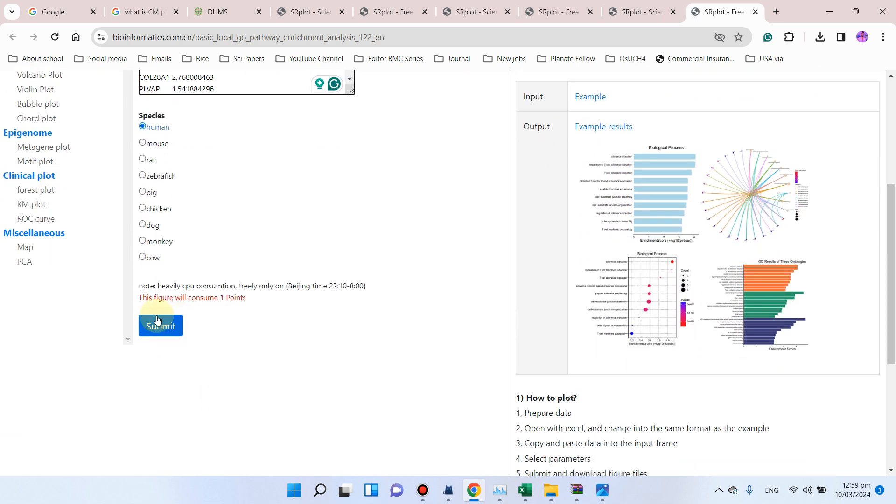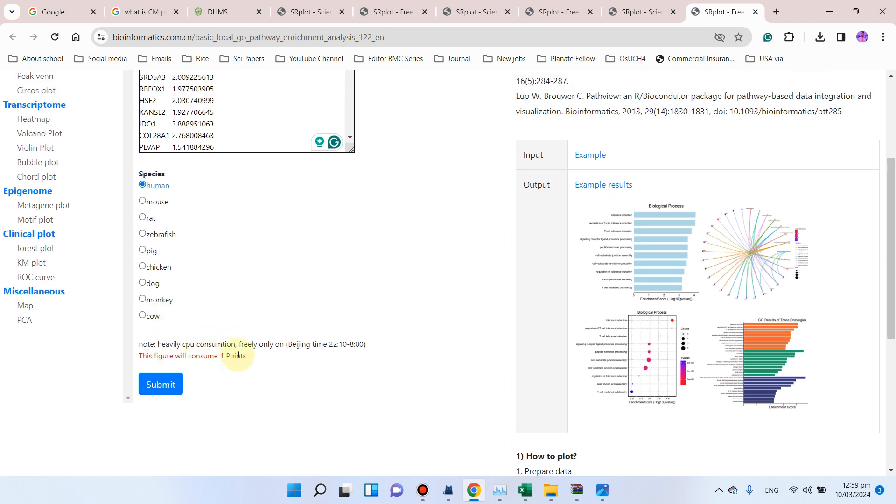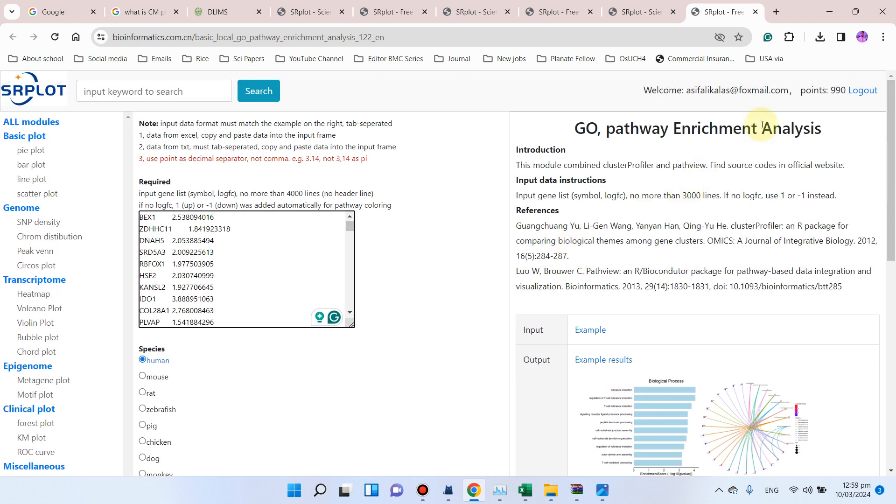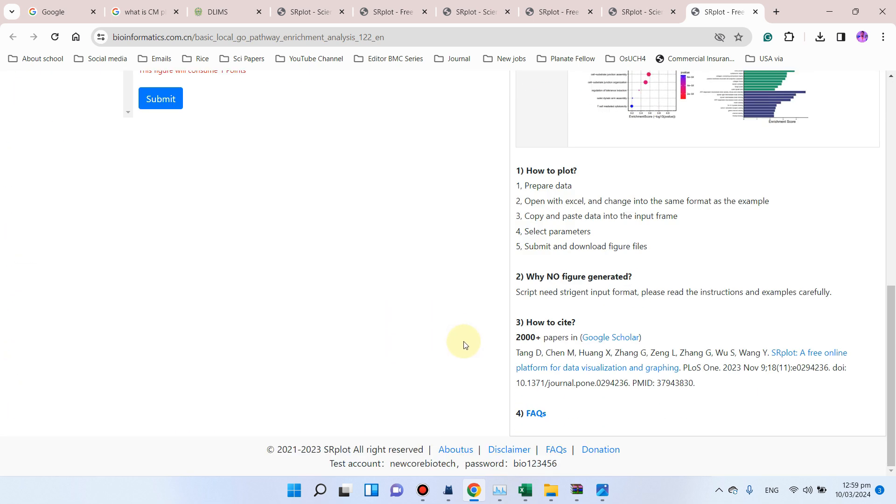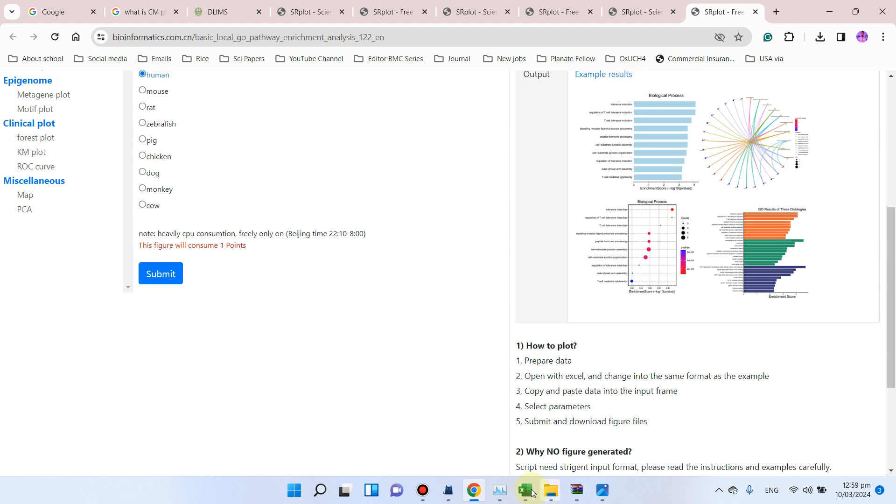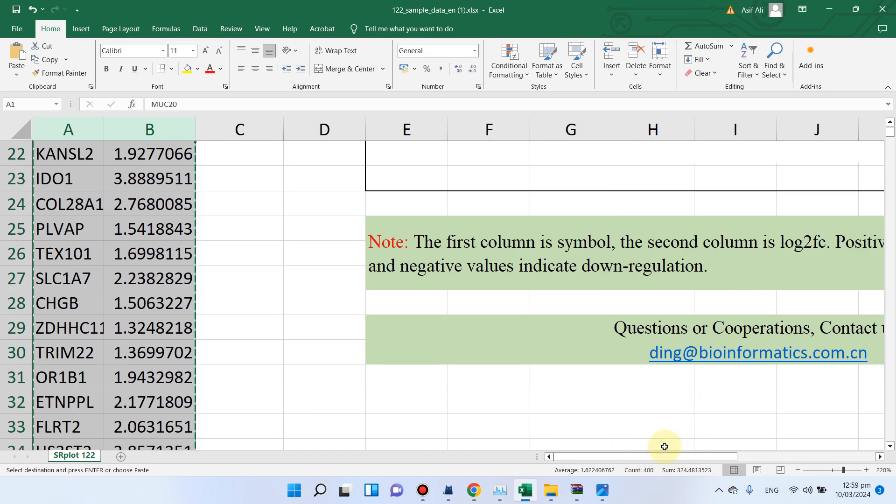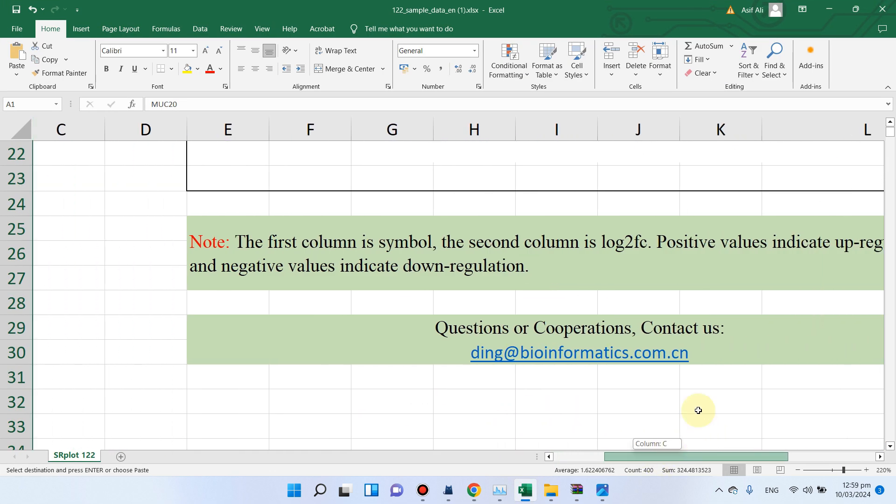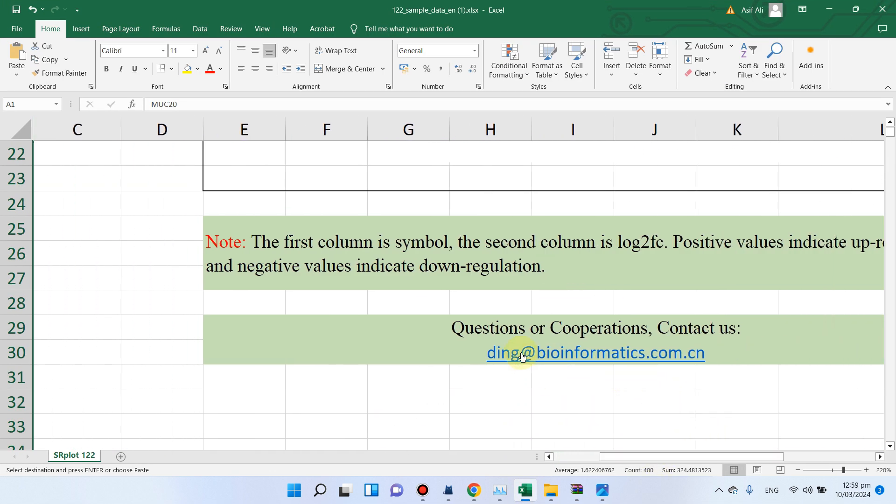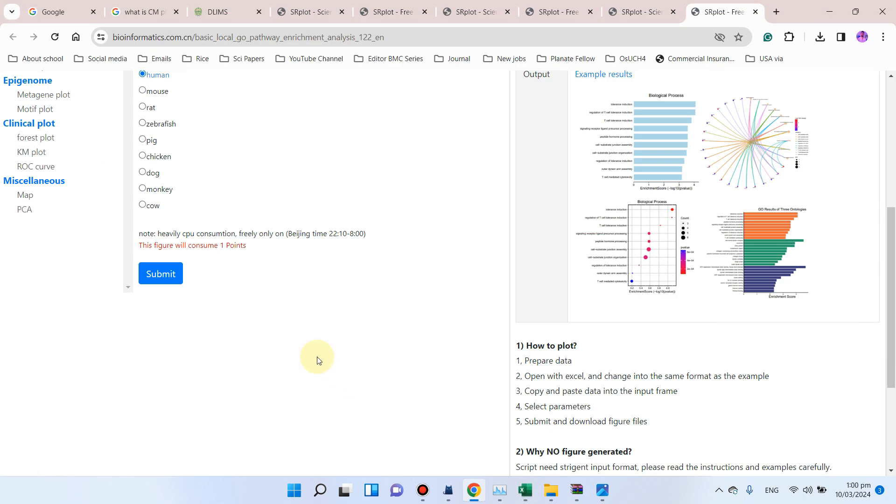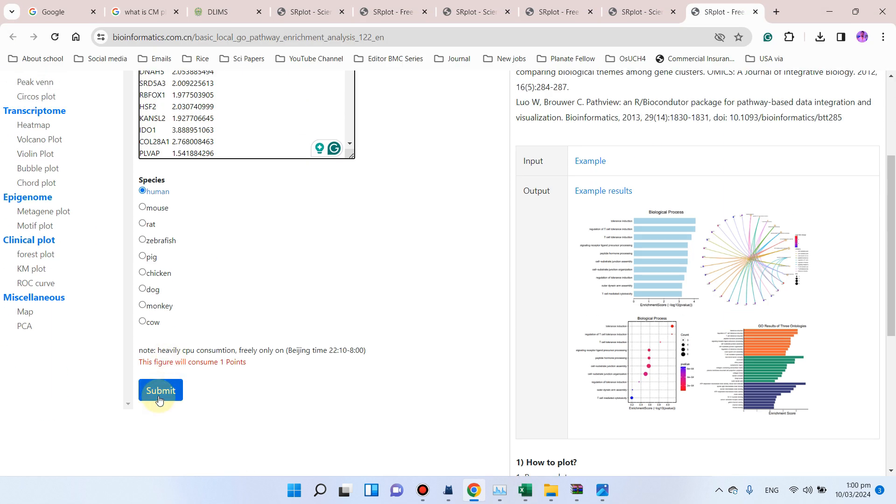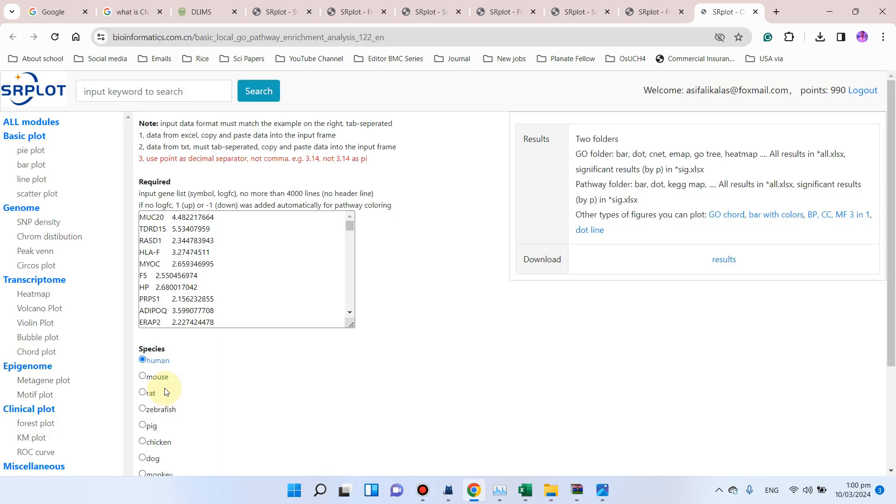Submit button. And you should remember that this figure will consume one point. And if you don't have points here, you can simply go to their email. If you don't have any points, you can email and request them to get some free points, so they will give you free points. And you can simply click on this submit button.